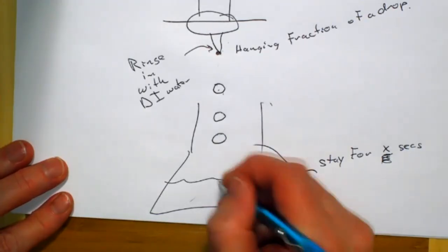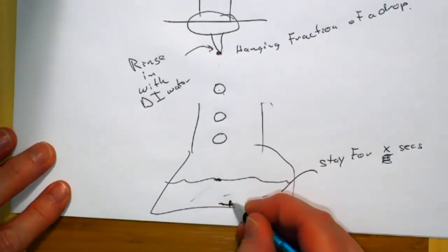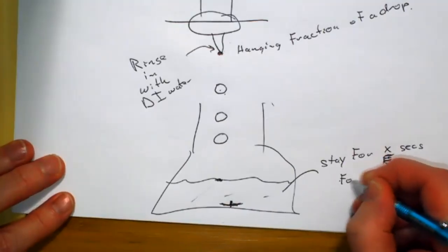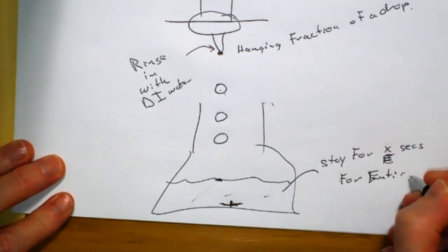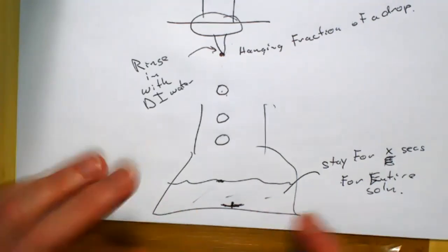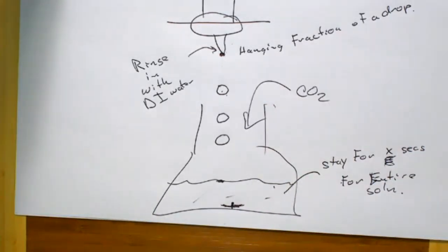You know, right when it hits, it's pink, even at the start, because there's a high concentration there. Once the stir bar gets going and it gets mixed in, it should stay pink for X seconds in a homogeneous solution, for the whole solution. Because people go, well, I'll save this one and use it for a comparison. But if it's a really light pink, the CO2 in the air comes in and it changes it back to clear.